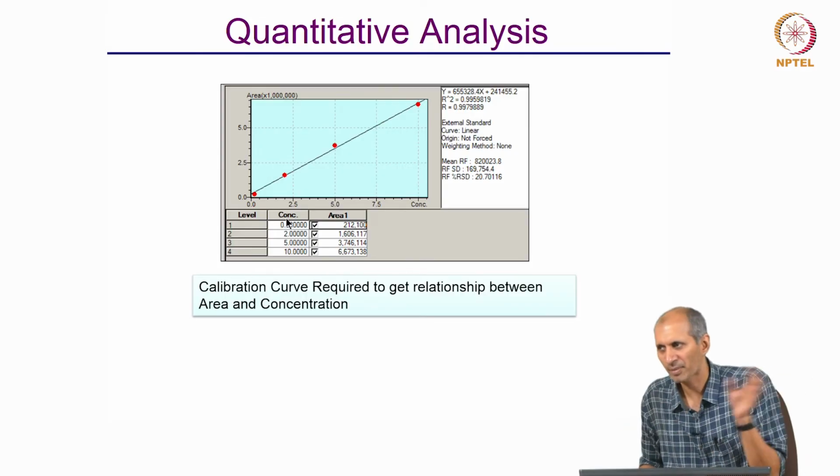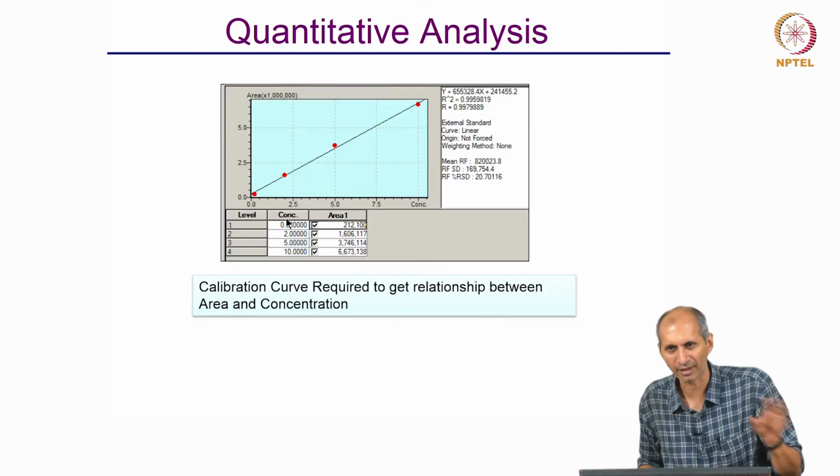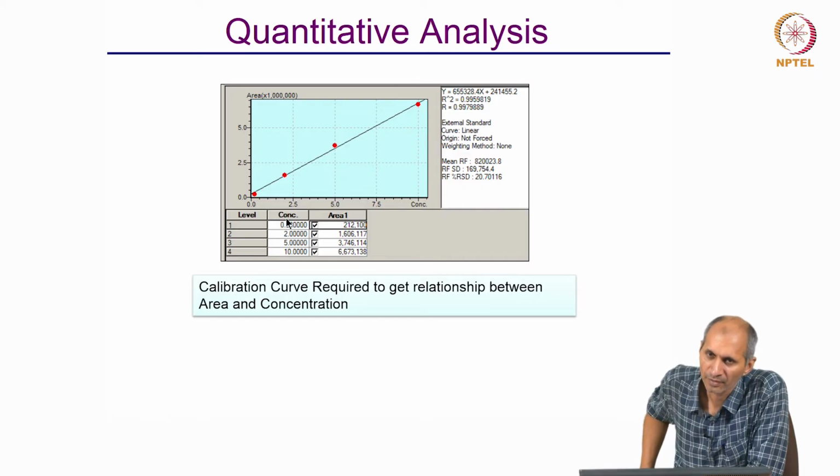Every time I do that, if I am getting the same, I do not care how much mass is getting lost in the system, this is happening, that is for sure. Okay. This calibration is done. If mass is getting lost, then concentration will also change. No, but that is what calibration is based on.